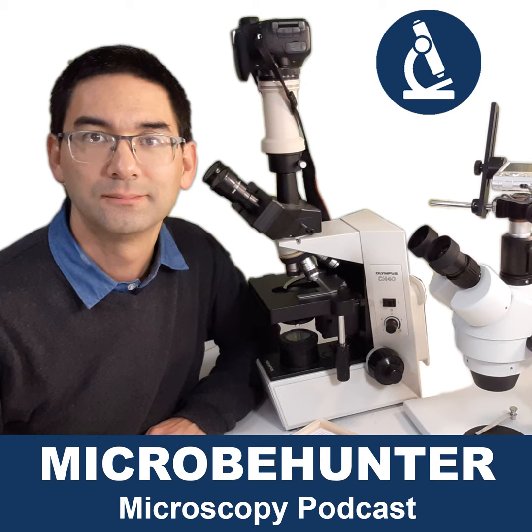There are two focus knobs, the coarse and the fine adjustment focus knob. You have to work with a diaphragm that controls the depth of field and contrast. You have to play around with the mechanical stage and all these things. There are more things that you can turn, in other words, right?